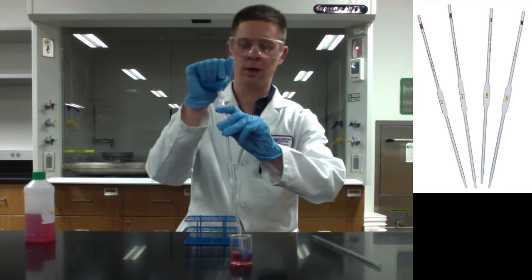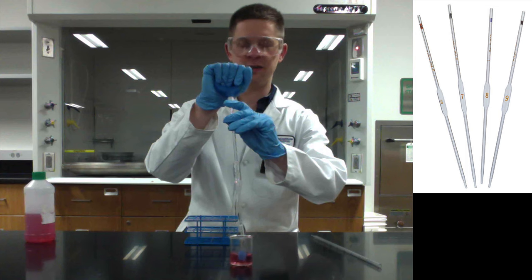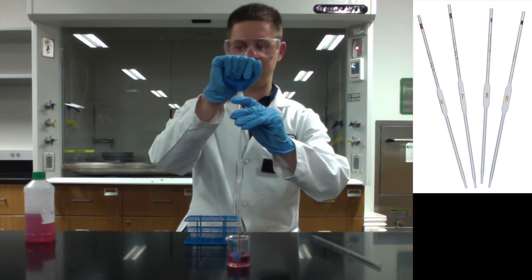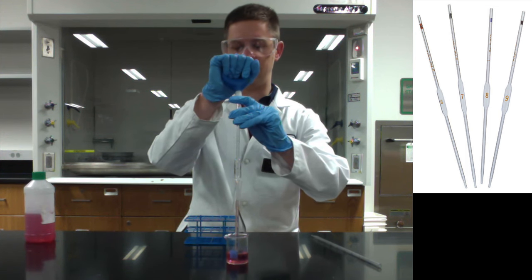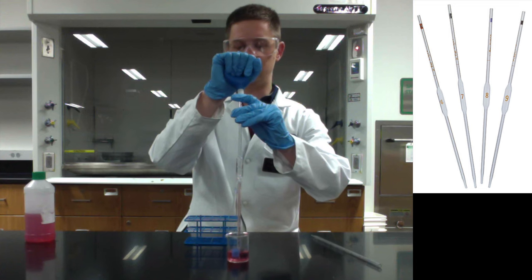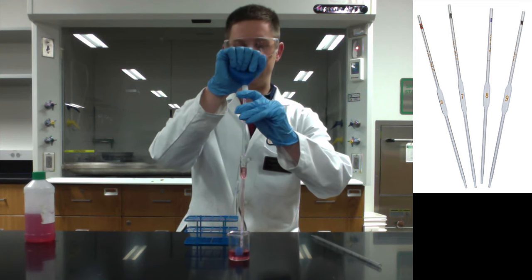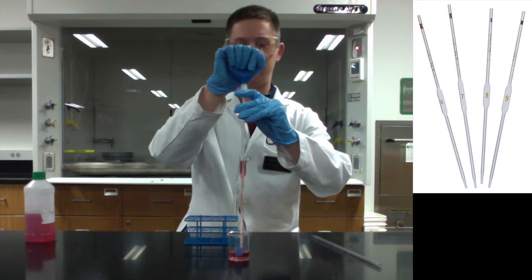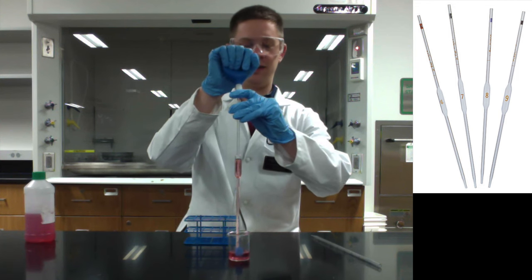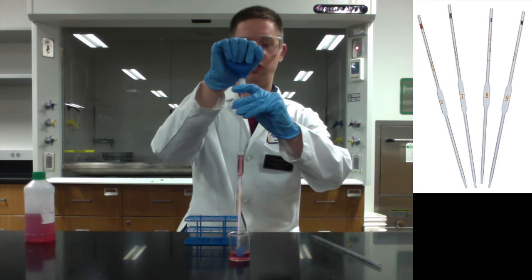So squeeze it first, place it there to seal it. It doesn't have to be super tight. You just need a good enough seal to get suction, and then start to release your grip, and you'll notice the liquid coming up the pipette and filling that bulb-like area. That bulb was precision crafted so that when you fill to the line, you'll end up with 10 milliliters of liquid.